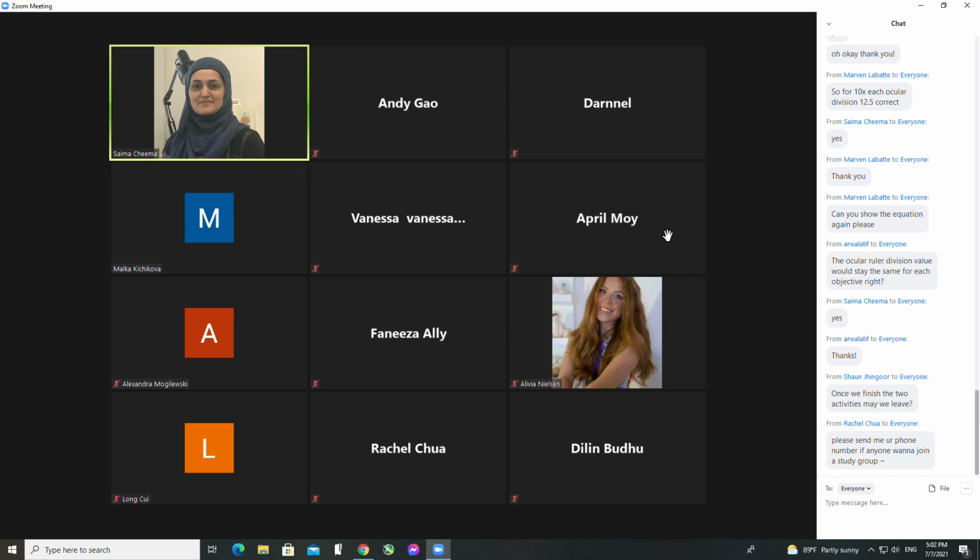You're not doing your conversions correctly, or I'm not understanding. Were you filling out the bottom table where you measure the size of pollen and stuff? You measured it under 10x and then 40x and then 100x. I understand that 100x is too large to measure, but under 10x, how many ocular units big was the pollen?